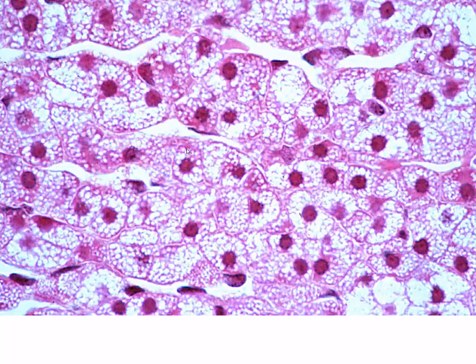Now, the fasciculata and the spongiocytes, they are so classic, so characteristic, it's going to be difficult to really confuse this. About the only thing I think you could possibly put this with as far as a look-alike in histology, if this were just a standalone slide and you weren't exactly sure what system we were talking in, you may confuse this with a multilocular adipose tissue or brown fat.